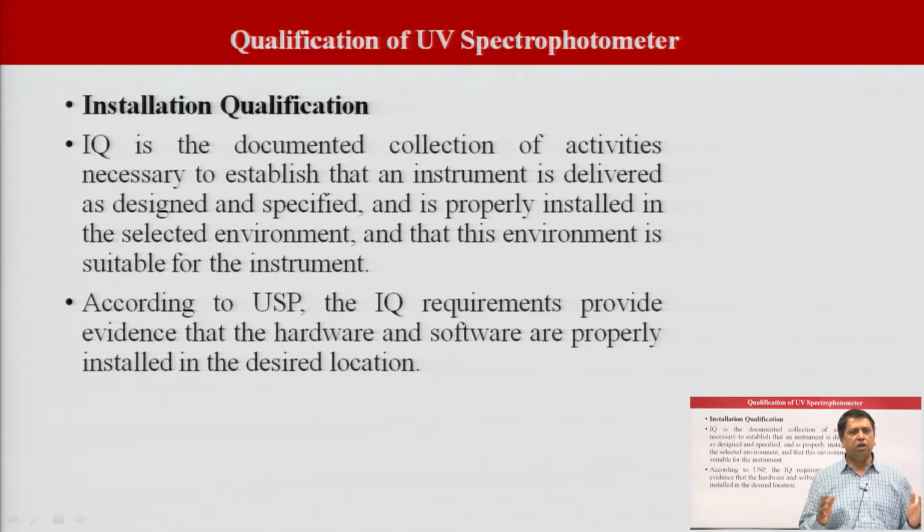So, all these things are included in the installation qualification. The proper documentation of these activities is included in the installation qualification.